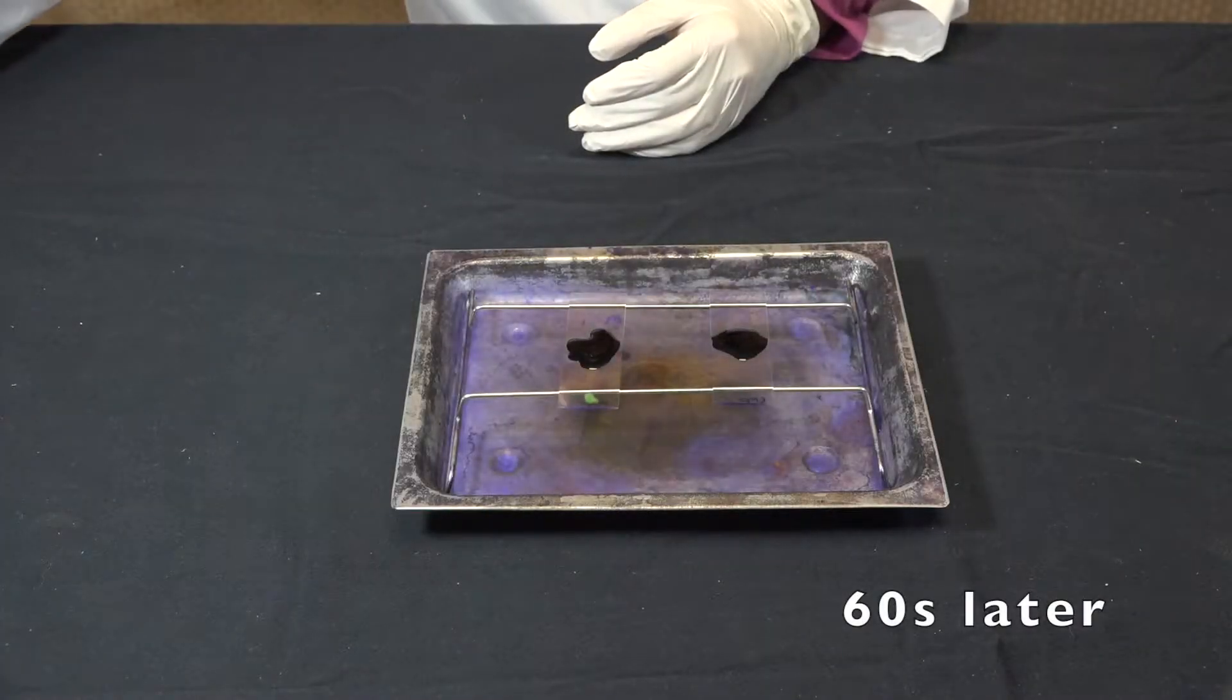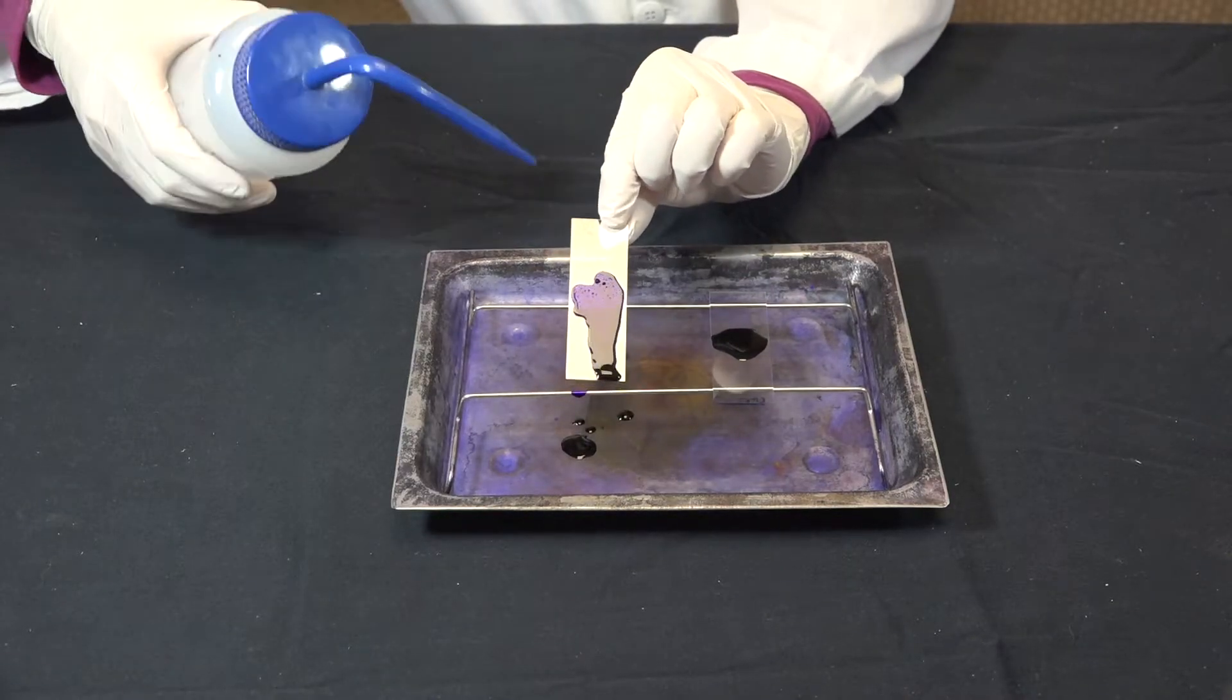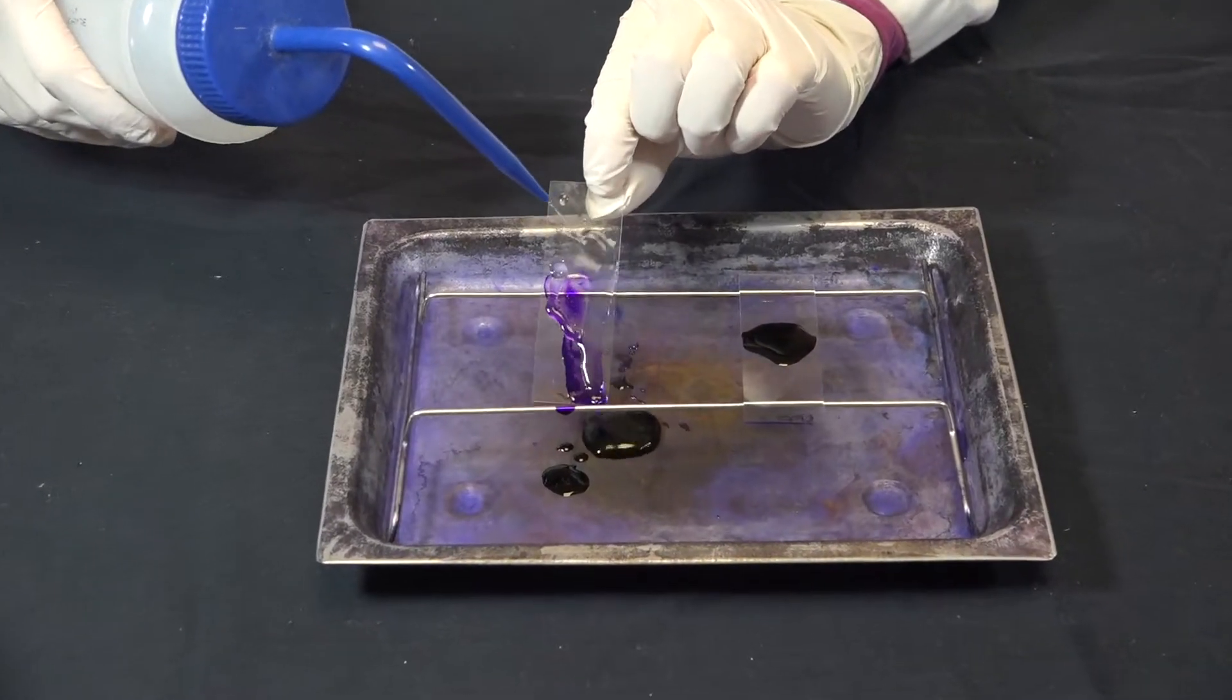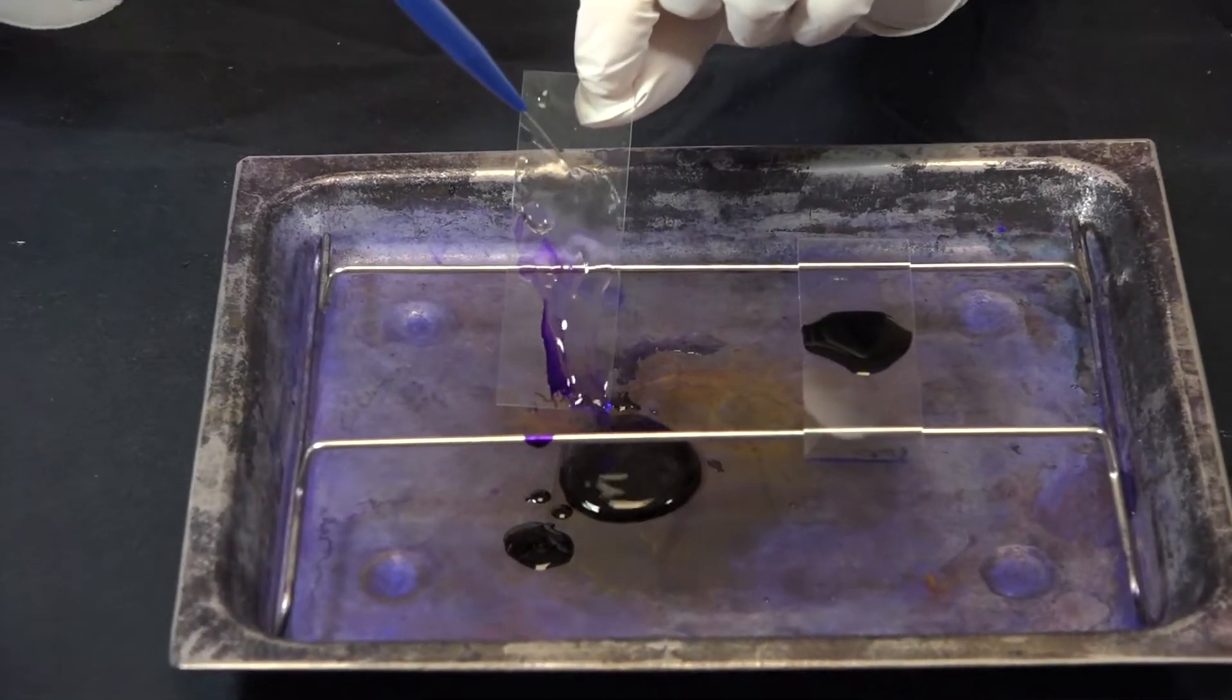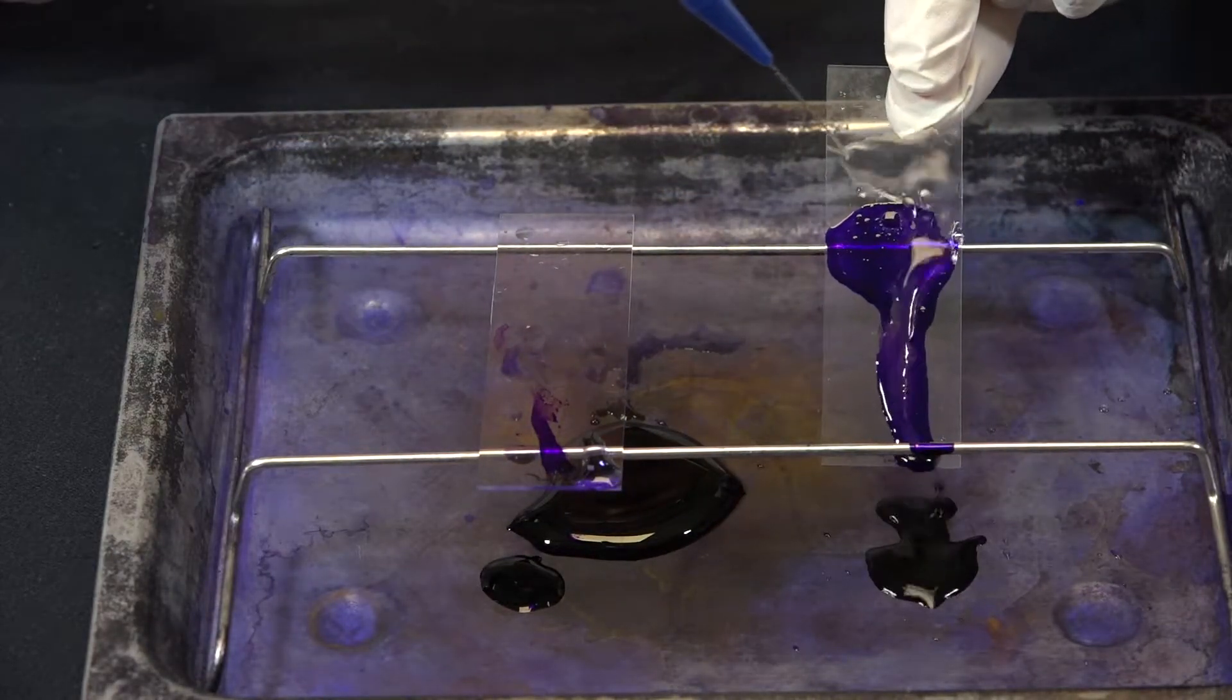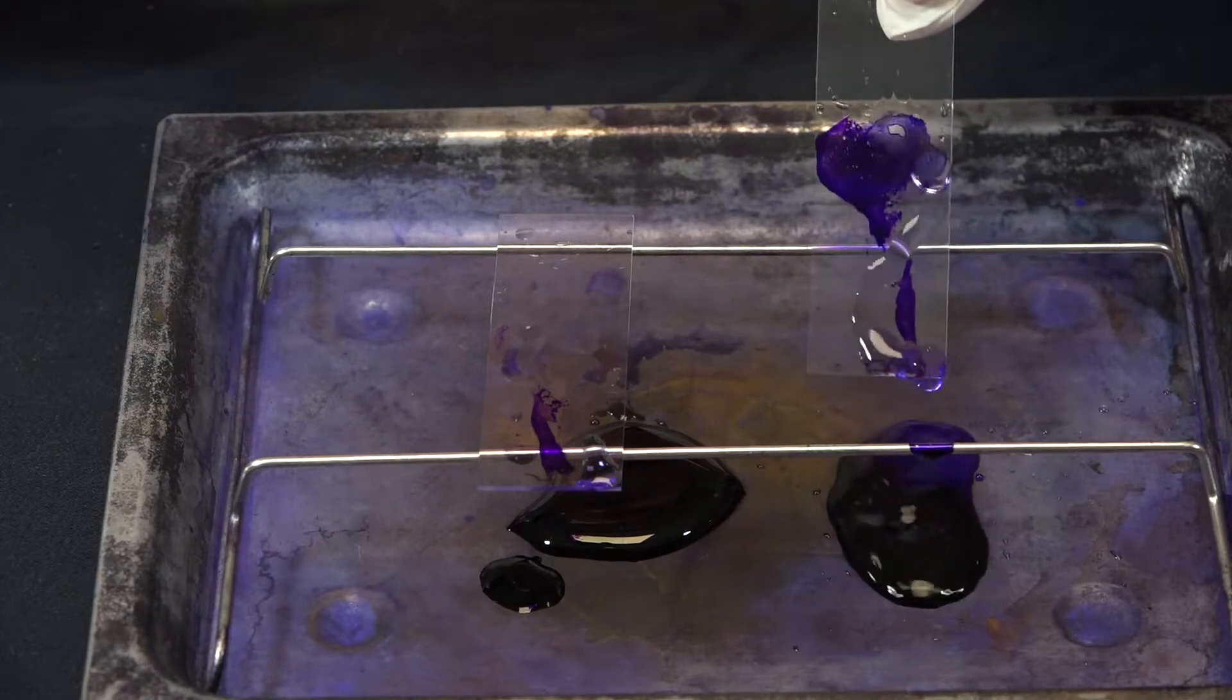Now I'm going to rinse off the excess crystal violet with distilled water. Spray the water above the smear and not directly on it. It's okay if a little crystal violet remains at the bottom of the slide.